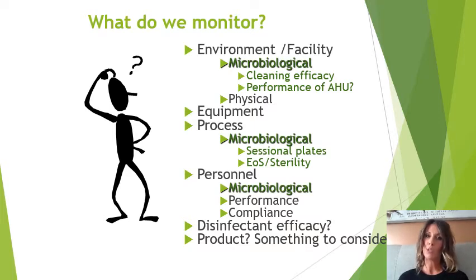We can also look at disinfectant efficacy. So as mentioned, we do microbiological monitoring of the clean room to check that our cleaning process is adequate. We also need to make sure that our cleaning agents are adequate because, as we know from methicillin resistant Staph aureus, MRSA, microorganisms can evolve and adapt, so we need to make sure that our disinfectant, our cleaning agent, is still efficacious and performing the job as expected, and there's no upward trends in our local microbial flora.